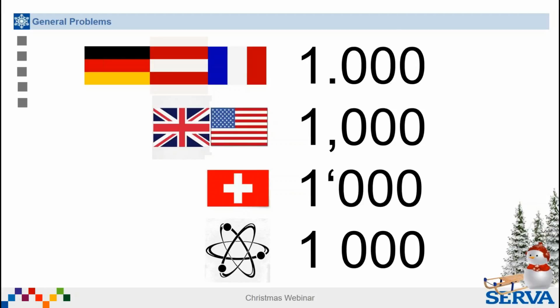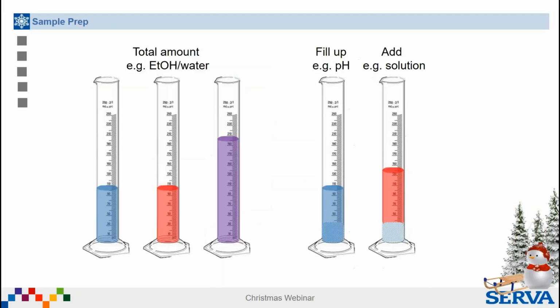If you don't do this and you copy it, then it is very easy and very common that, for instance, 1000 microliters will become 1.0 microliter, and everything would go wrong then. So please be aware of this, and there will be no problems anymore.